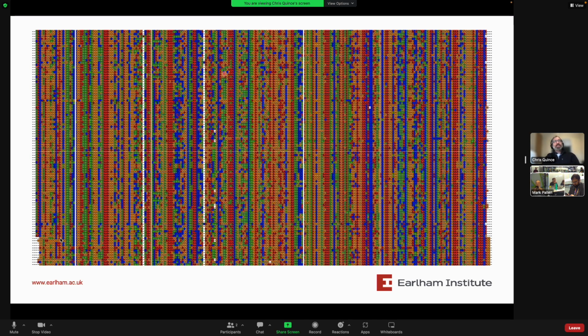I suppose this is quite a sad indication of how much bioinformatics I was doing even 10 years ago, but 15 years ago I did my first 16S sequencing, and I just looked at the sequence and I could immediately tell it wasn't 16S because of the frequencies of the different base pairs. As it turned out, the sequencing center had accidentally sent me someone else's sample of human DNA sequence. And that just sort of shows how if you spend your whole life looking at sequence, you can get an understanding of what it should look like, right?